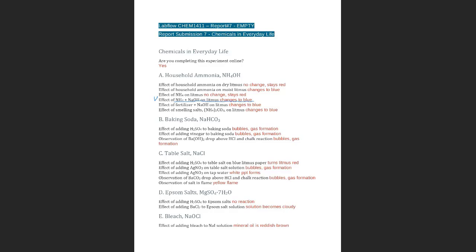And then you look at the fertilizer and you say, okay, is it different or is it the same? It's the same. So are we assuming that the fertilizer contains ammonia? We can say yes, because we come here and we see that it has the same effect of an ammonium salt. So it might have ammonium. So this is the way that you are going to answer. And then what happens with the smelling? Let's look at that.